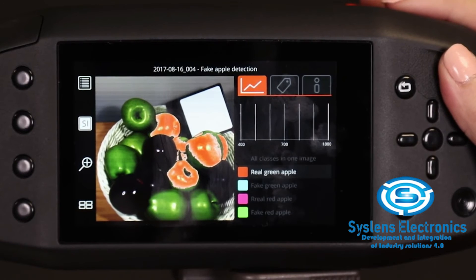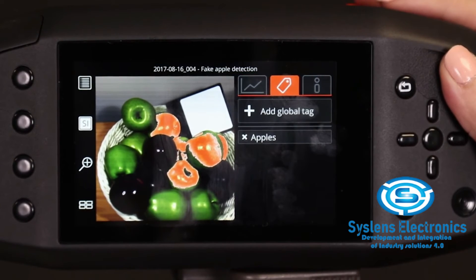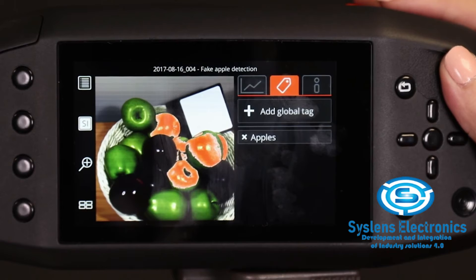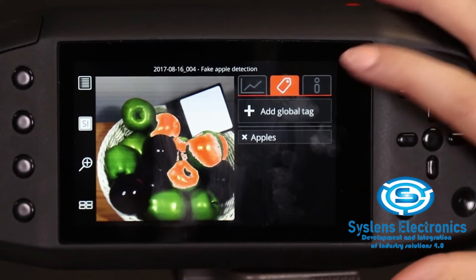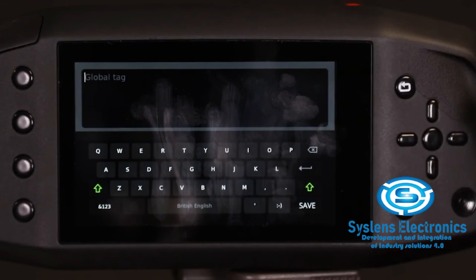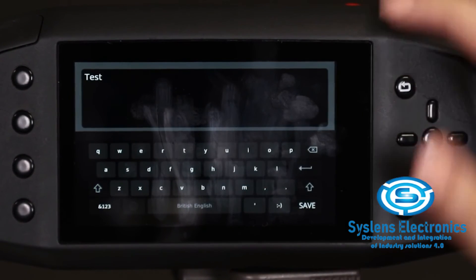Let's move forward to the tags view. You can assign several material tags to specific pixels in the data, or global tags that label the full dataset. These tags work as your personal notes. When importing the data to IQ Studio, the tags are imported alongside the data. To add a new global tag, tap the add global tag button, type in the tag, and press save.